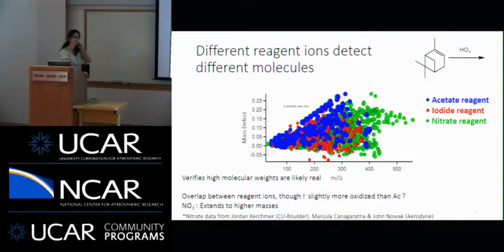The nitrate CIMS data came from Jordan Krechmer and the Aerodyne crew who were out at Caltech with a nitrate CIMS instrument. Again, there are several things you should notice from this. First off, all of these instruments see these really high molecular weight compounds. Some instruments, namely nitrate CIMS, see higher molecular weight species, so this tells us that nitrate is accessing a different type of molecule. But we also see that acetate and I- see different molecules. What's interesting is that there isn't a very good pattern as to which molecules each system sees.